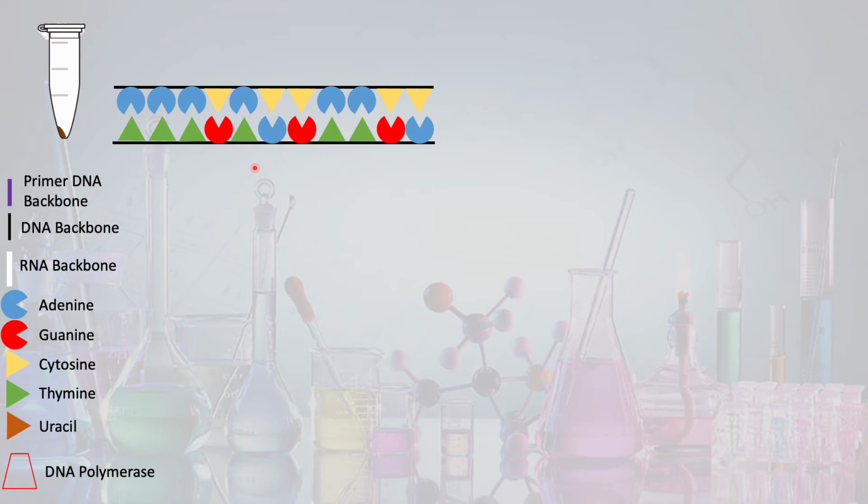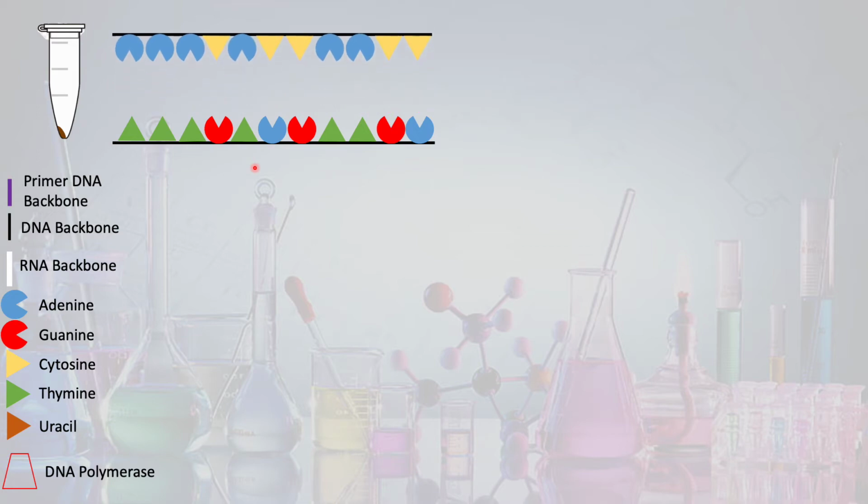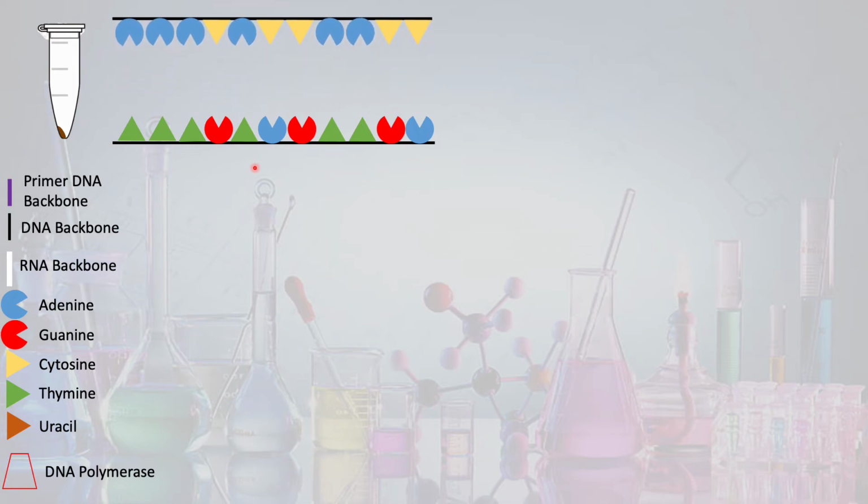So during the first step of our actual PCR, so polymerase chain reaction, we heat up our samples, our two DNA strands separate, and so before all this occurred, we loaded up our sample tubes with a bunch of different nucleotides, a special DNA polymerase that can tolerate and function in high temperatures, and our specific primers that we've generated that are going to link up and only bind to segments of our gene of interest.